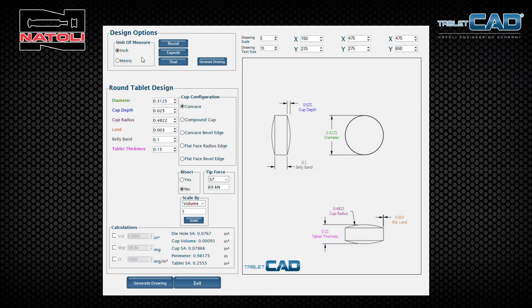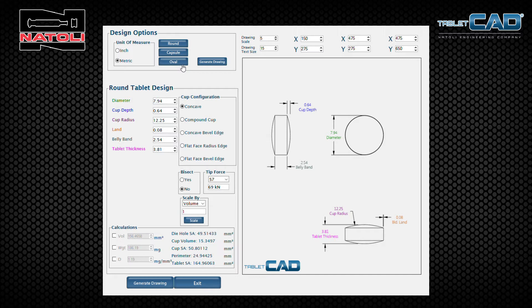Your first point is to select either inch or metric, so all the values will be in metric and displayed in millimeters as well. Next to the units of measure, you have round, capsule, and oval tablet design selections — these are the basic tablet designs that Tablet CAD will allow you to draw. Just below that are the tablet parameters that you will be inputting into the program.